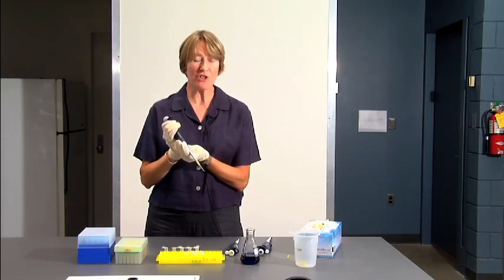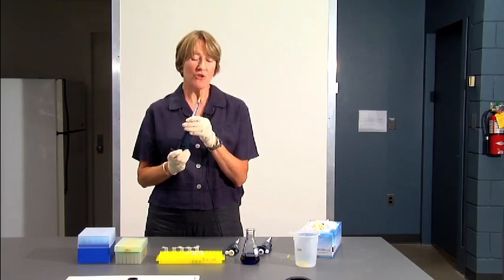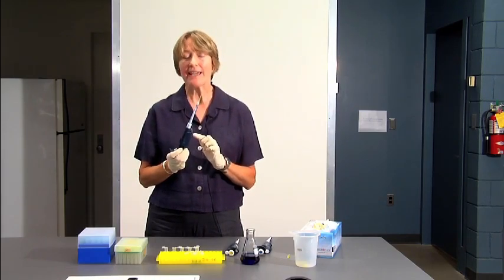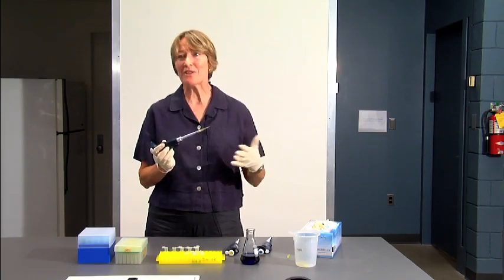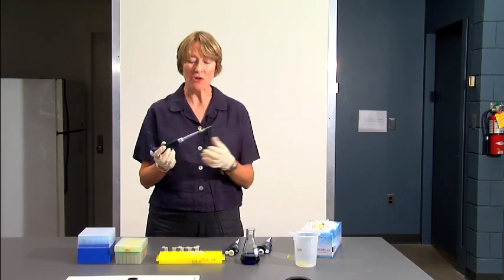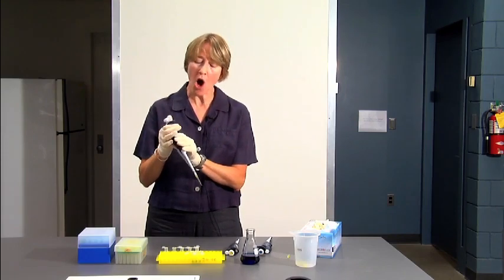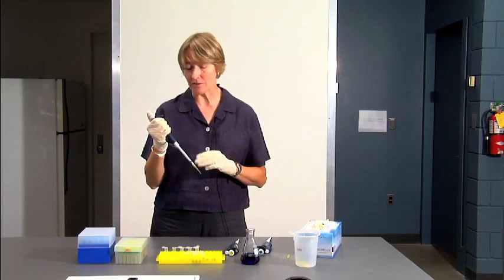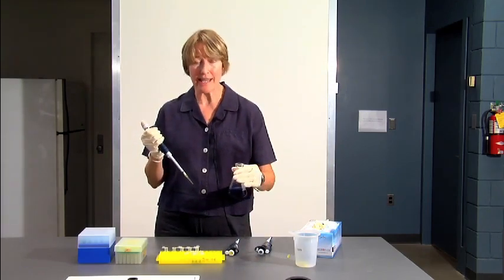Another thing you should never do is turn your pipette tip up like this. If you do that, the fluid in the tip will flow down into the pipetter, it will contaminate the pipette. And if you're using radioactivity or bacteriologicals, that means we now have to take the pipette apart, clean it out, and start over and recalibrate it. So always hold your pipette tip in this position or at an angle with the tip down. So we're going to take some of our sample.